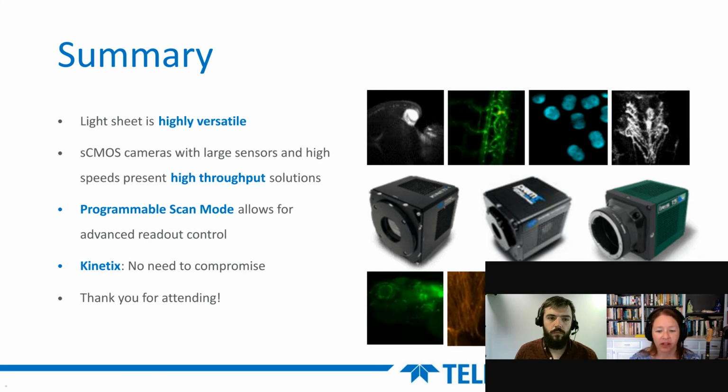So let's get started. Our first question is, what software are your cameras compatible with? Thanks, Marie. So the cameras that we offer and the ones that I spoke about in the presentation are suitable for all the software you'd use with major microscope company software. Also a great deal of open source software. So we like to use Micromanager, and there's other open source software such as LabVIEW.